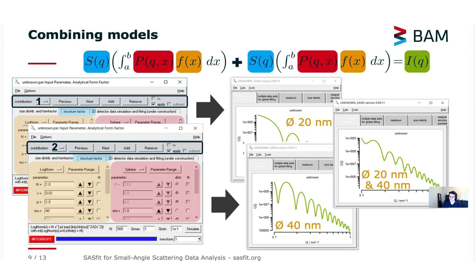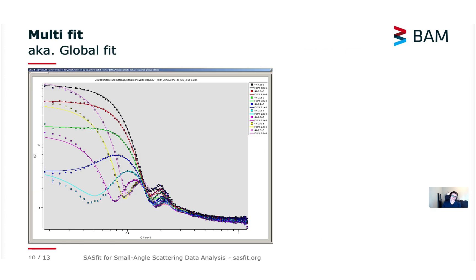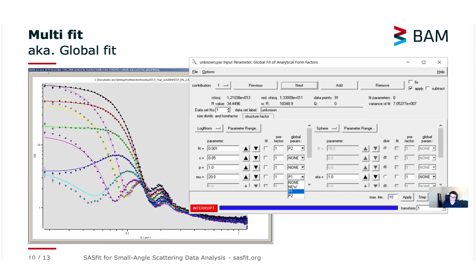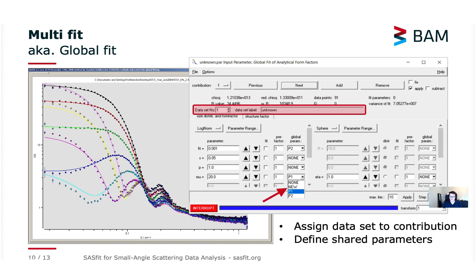And going one step further there's even a bit more complex configuration window for so-called global fitting which provides not only contributions but also data sets which can be assigned to contributions. This is highlighted here in red so you can assign to each contribution a certain data set for which it applies. This enables you to do some global fitting across multiple data sets multiple measurements as shown in the plot window in the background with the different colored curves which means you can load different measurements and for example different environmental settings or environments and fit all of them to a single model you can configure here.